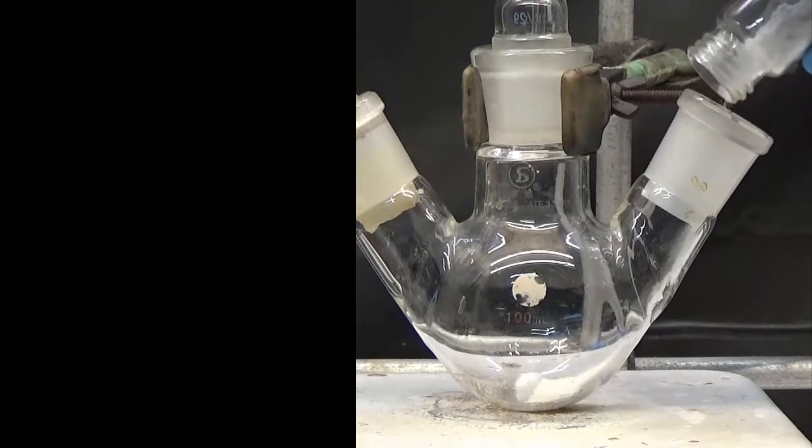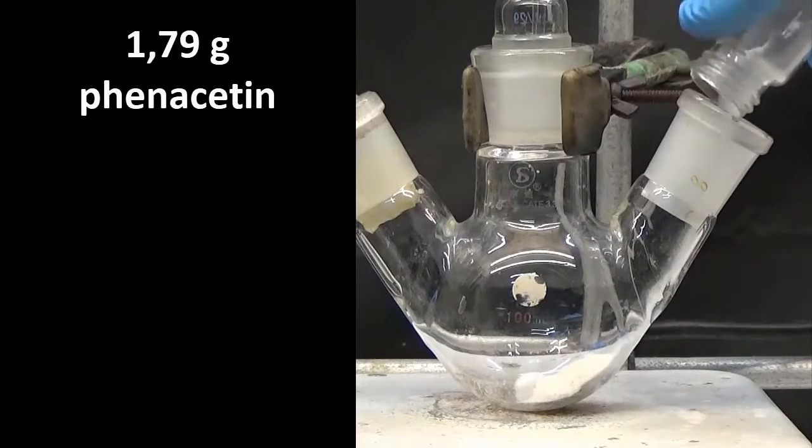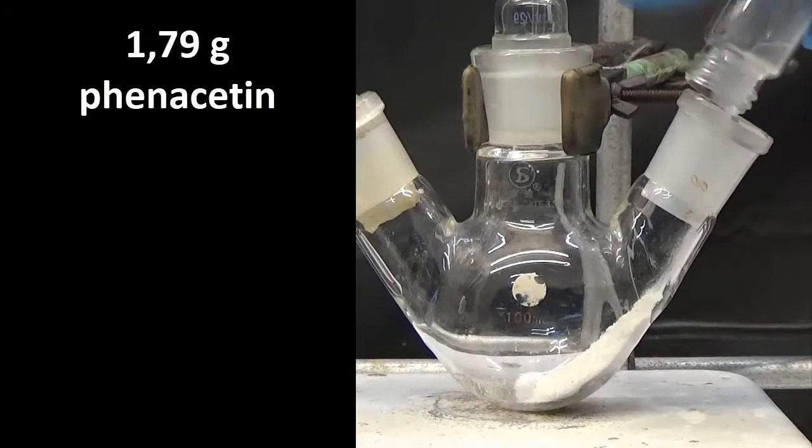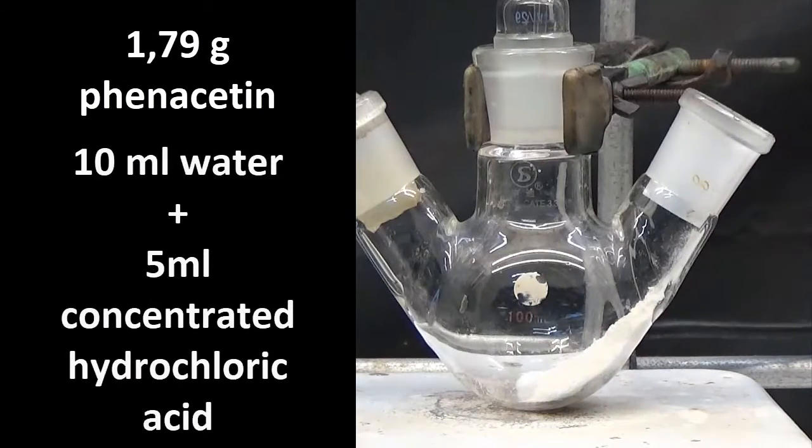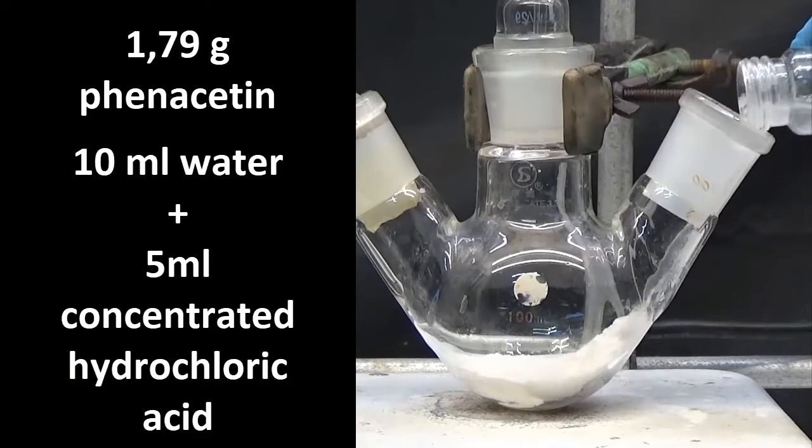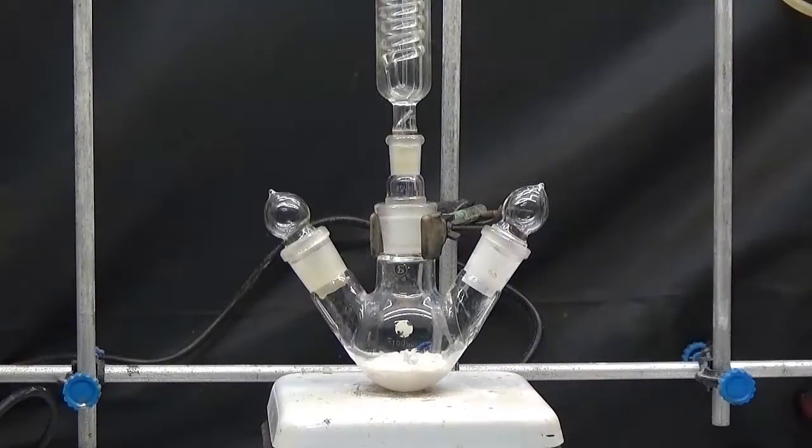For this operation, we will put 1.8 grams of phenacetin into a 50ml flask with three necks. We added a 5ml solution of hydrochloric acid concentrated in 10ml of water and heated under reflux with agitation until total dissolution of the solid.